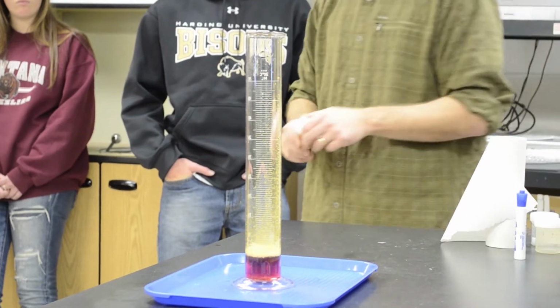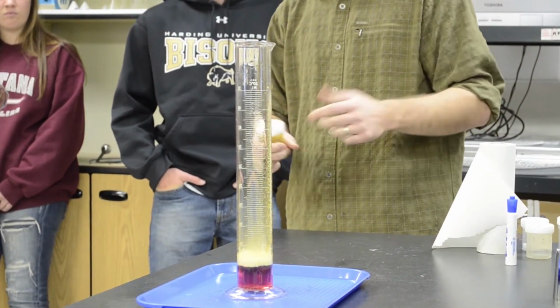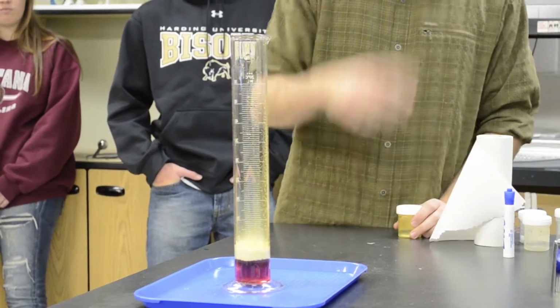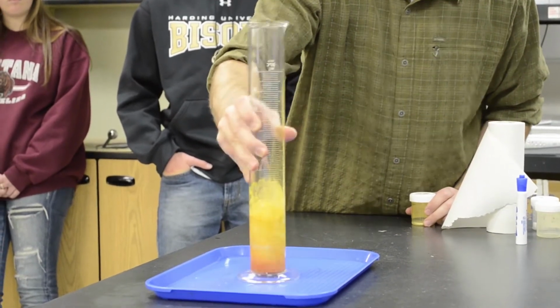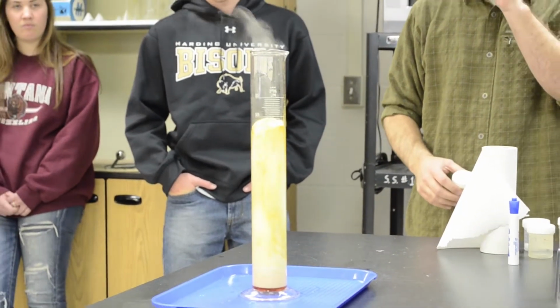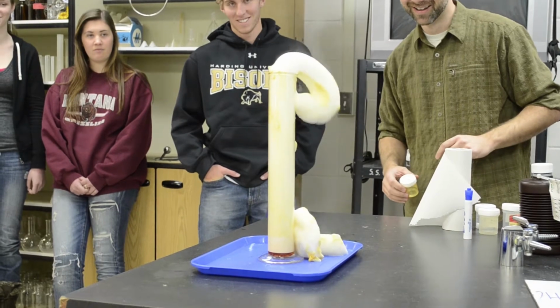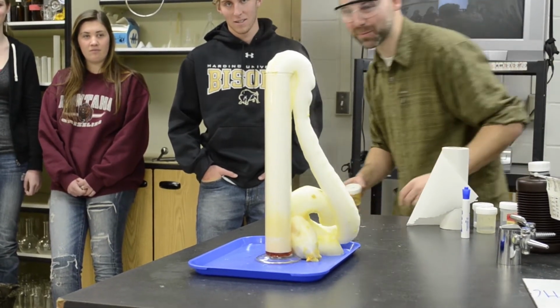You see the production of that gas there? See how that sped that up? Pretty sweet. The problem is that the reaction rate's still pretty slow, although that's building, isn't it? So let me just swirl it around a little bit. Oh, here it comes. And there it goes. It's really hot. Can you see the steam coming out of this bad boy?